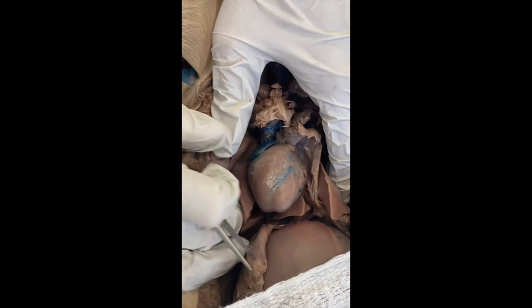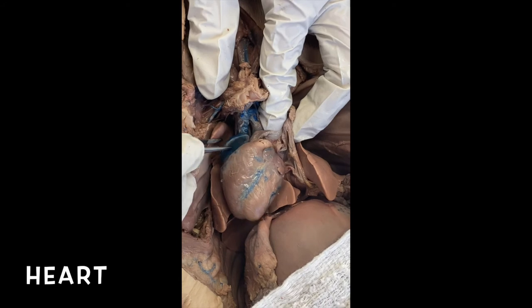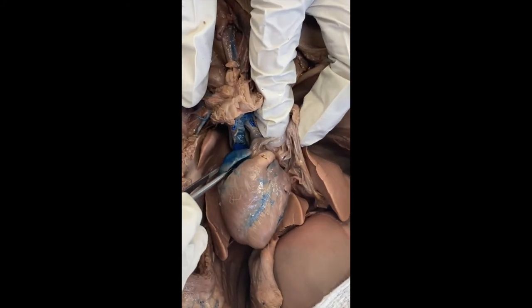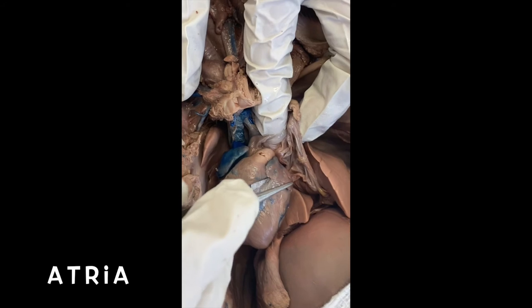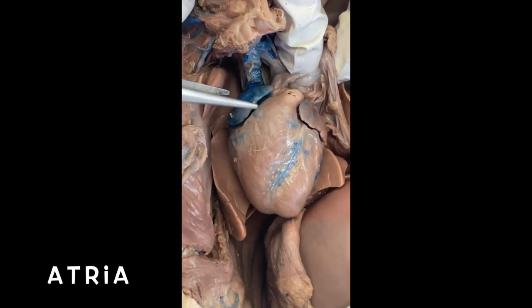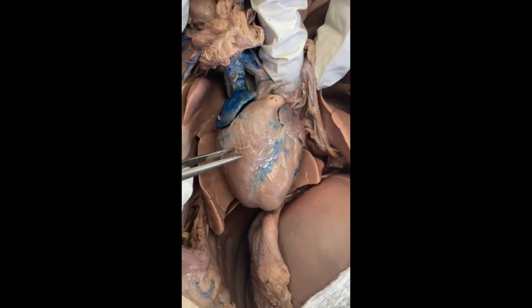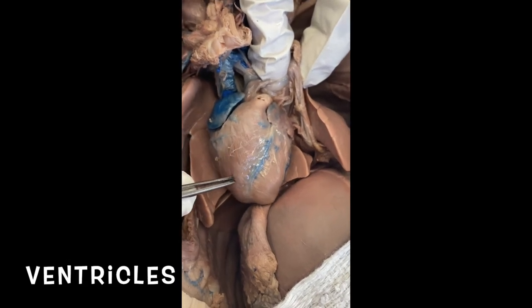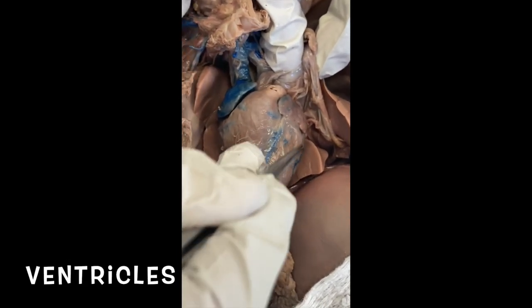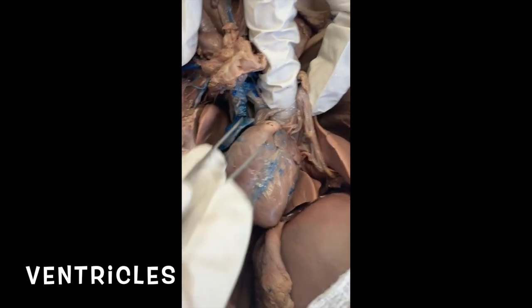All right, so we're gonna start here in the chest cavity. I'm gonna go over the heart and the lungs. So here's the heart. And when we look at it, we have these tiny flaps, smaller in comparison to the rest of the heart. Here's one, and I'll pull this one back right there. So this would be the right atrium, and this is the left atrium. And then here would be the right ventricle, and this would be the left ventricle. The section of the heart that looks a lot more muscular, that does the pumping, these are the ventricles, and the flaps up here at the top are the atria.